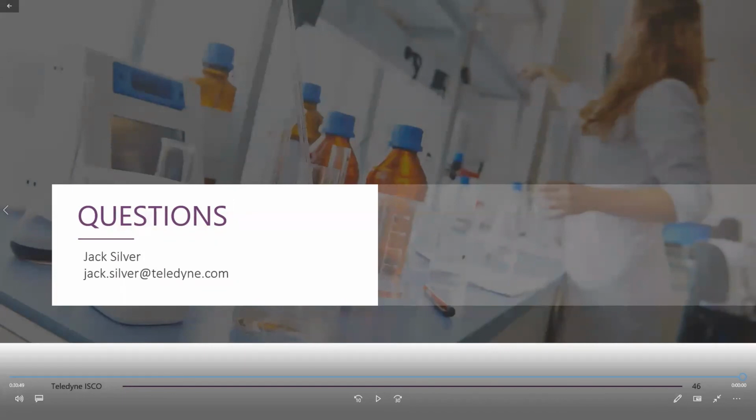Another question is, I don't use an isocratic hold at the start of the run. Why is that? Truthfully, I never found the need for one. The dwell volume in your HPLC system does make enough of an isocratic hold at the beginning of the run that I don't need one. And the isocratic holds might interfere to some extent with the focus gradient calculations.